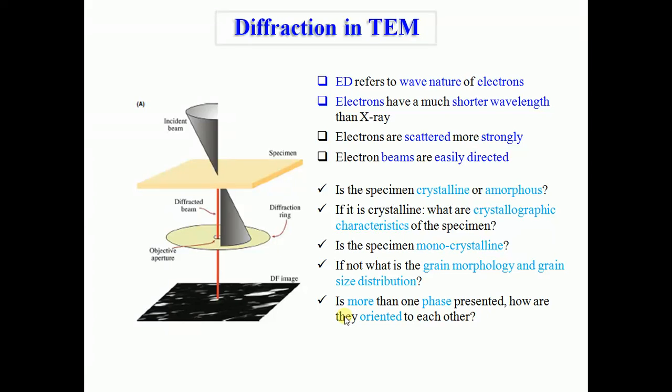So this was about the TEM image formation. Now we proceed further to look at another dimension of this technique, diffraction. As I said, if these electrons are accelerated at very high voltage, for example 100 keV, then the effective diffractive wavelength is very small, and this wavelength is comparable to the interplanar spacing. These electrons have dual nature, particle nature and wave nature. The wave nature of these electrons can be utilized to study the diffraction of very thin samples.